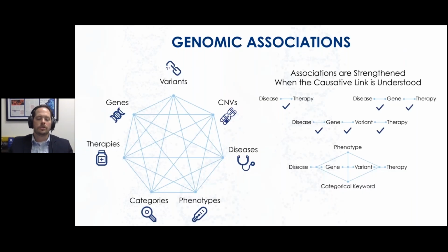But Mastermind isn't just a repository of information, as Andreas alluded to. It is an intelligent system of genomic associations. So I'd already spoken to on the previous slide how Mastermind is organizing information around genes and their variants and how they relate to disease causation. That was articulated in its utility by Andreas in his use case examples.